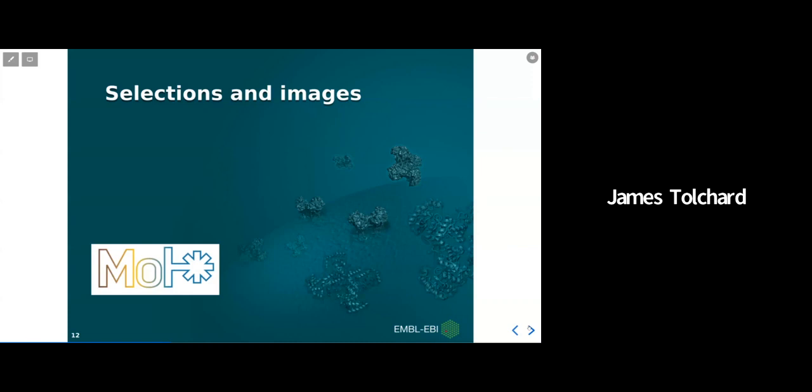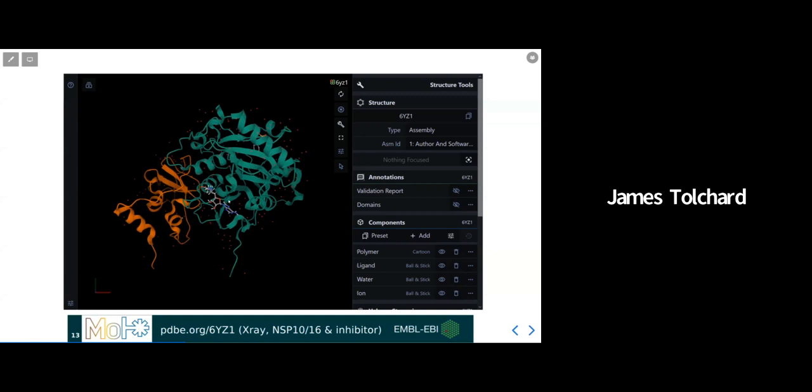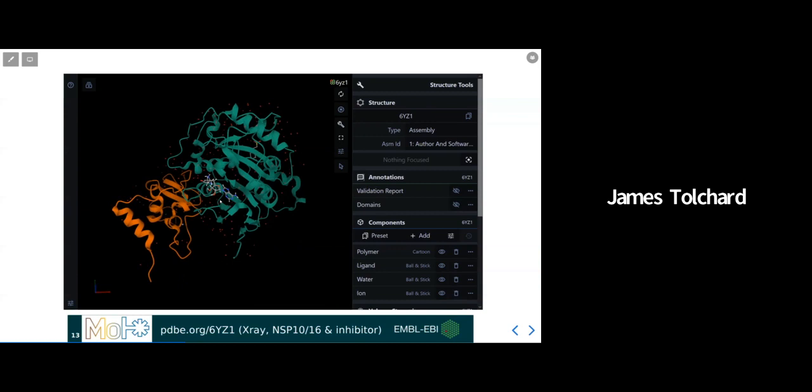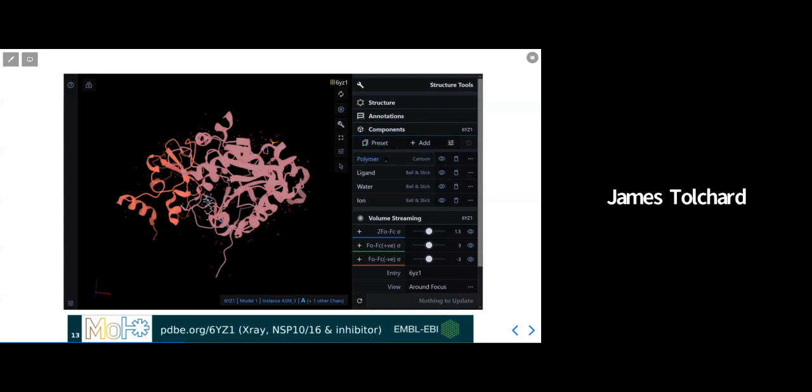Following on from the basic controls and representations, I'll now show you the selection tools you can use to help create images with more detailed aspects, and how we can then download these for use in our work. To do so, I will jump straight to a structure of a heterodimeric methyl transferase from the SARS-CoV-2 virus, with the inhibitor sinefungin bound in the active site. Hopefully, you can already make out the two distinct protein chains here in green and orange, as well as the ligand sinefungin, and perhaps a few waters and small molecules as well.